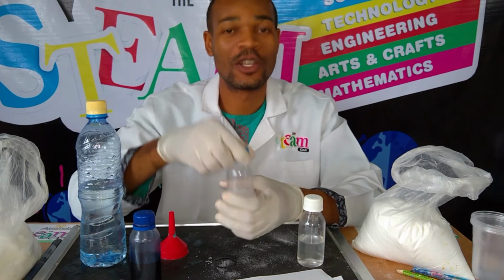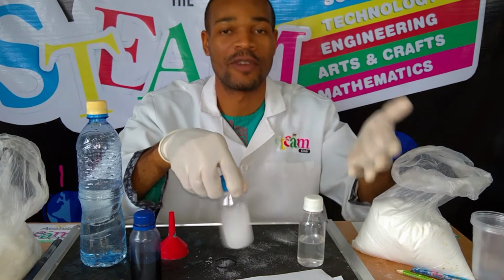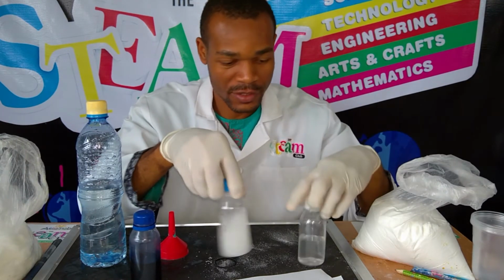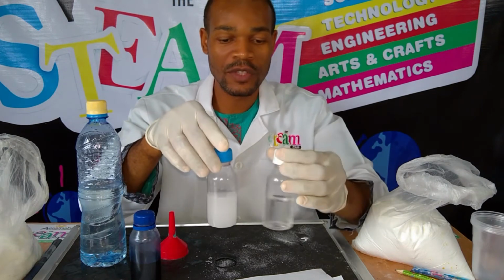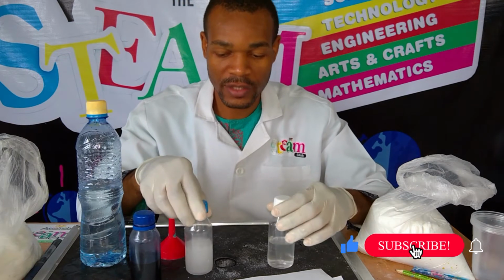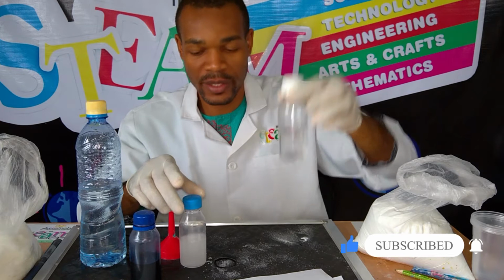So we'll call this an exothermic reaction, which means it gives off heat to the environment. Exo, that's outside. This one, endo, that's inside. Okay? And when I leave these two solutions to stand for a while, they're going to get clear. This one is somewhat chalky or hazy, while this one is now clear, all dissolved.